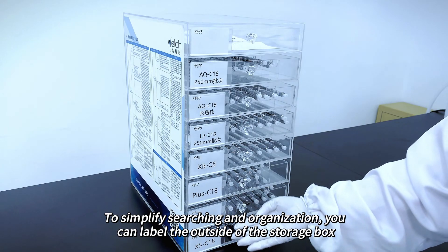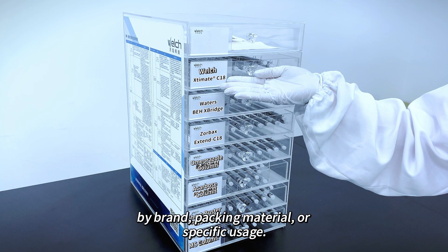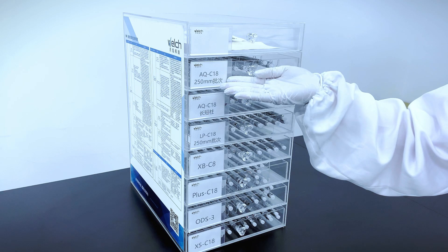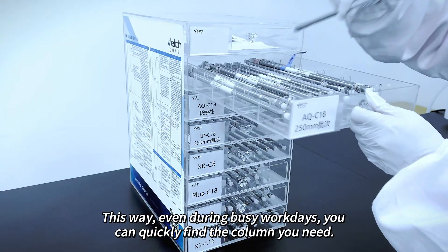To simplify searching and organization, you can label the outside of the storage box by brand, packing material, or specific usage. This way, even during busy workdays, you can quickly find the column you need.